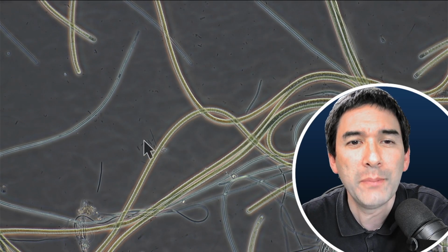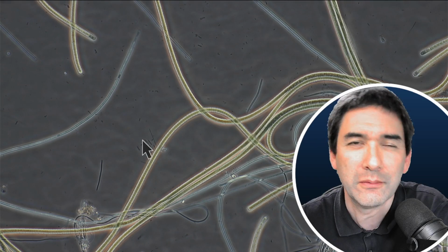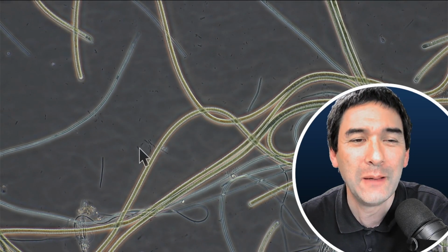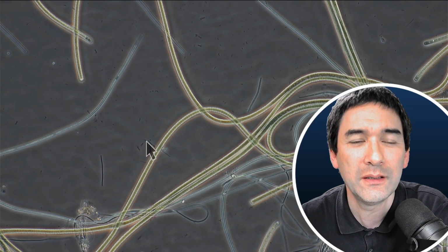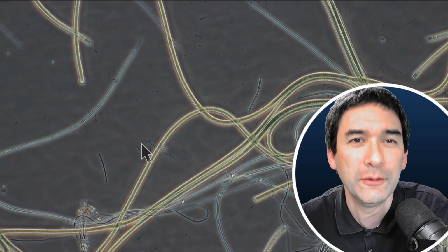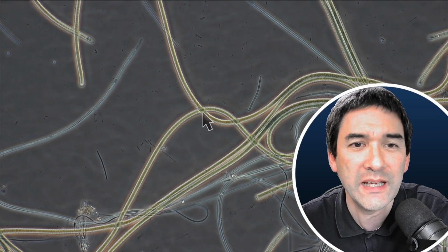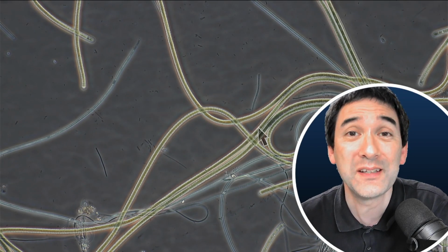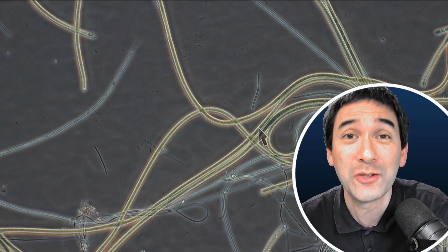And these are regular bacteria, regular under quotation marks, because what does the word regular mean? These are also bacteria. And it becomes quite evident that those bacteria look quite different from, again, the cyanobacteria, which you see over here. Still, they are much more related than the cyanobacteria are related to the algae.